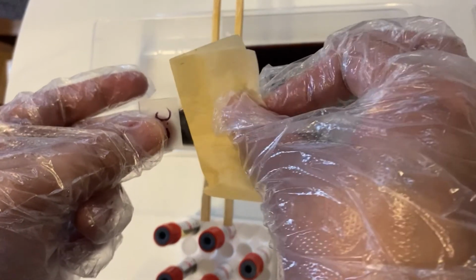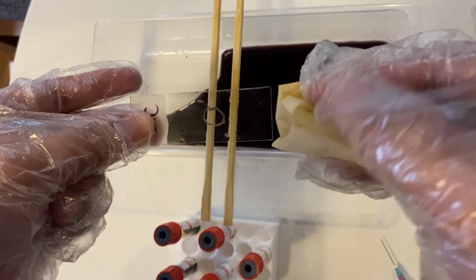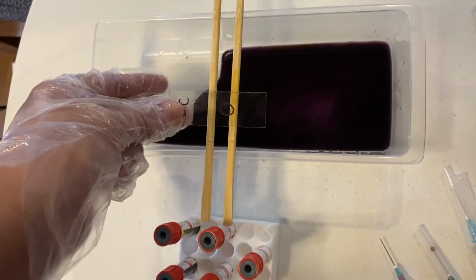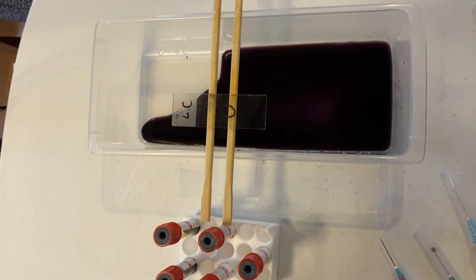Gram-positive bacteria are viewed as purple under the microscope, while gram-negative bacteria are viewed as pink under the microscope. Now that our glass slide is dry, it is now ready to be viewed under the microscope.